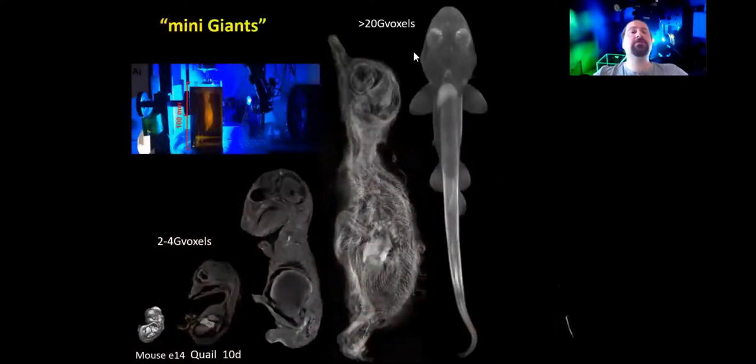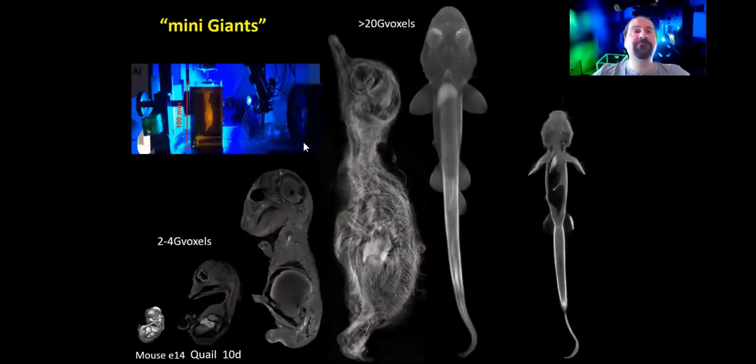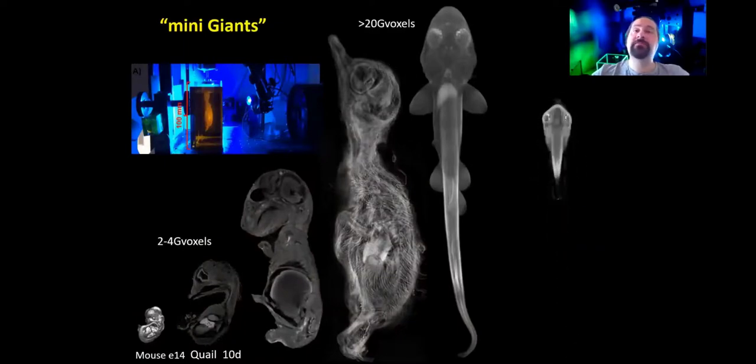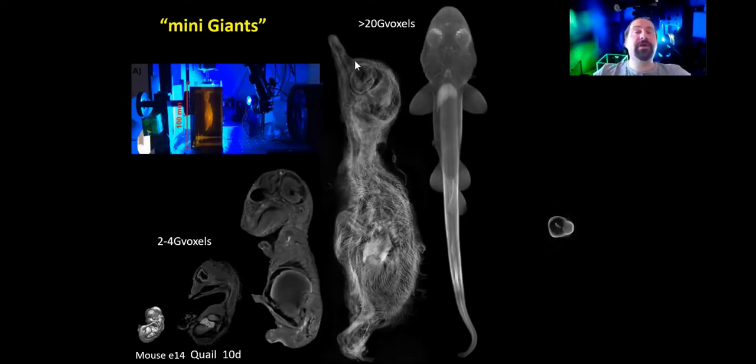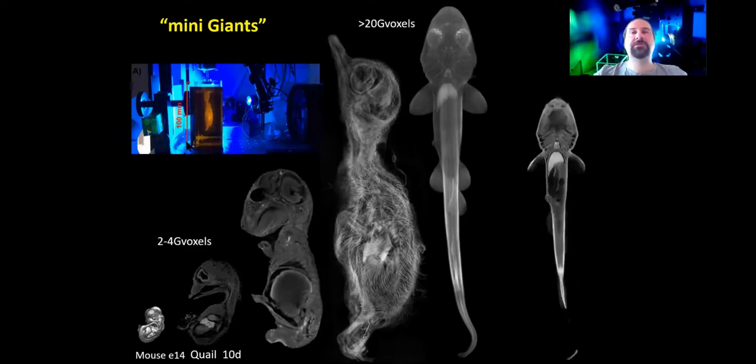So how far can we go? And again, by luck or serendipity, I was also given this duck, probably very close to full term, which we were able to image. And actually you have the setup in here where we used to image this, and now we're talking about 10 centimeters, a full 100 millimeters. These are really giants that you put in a microscope.